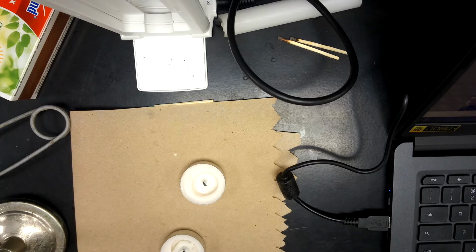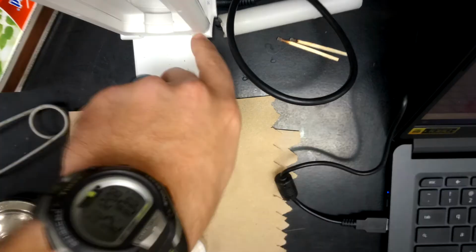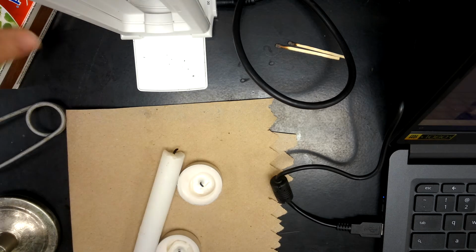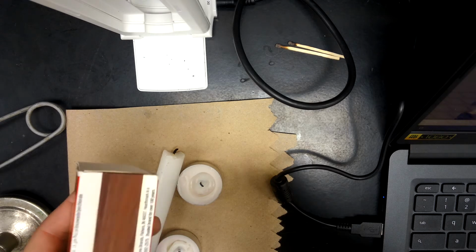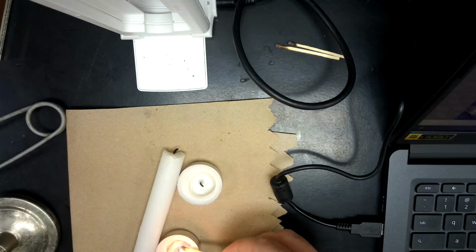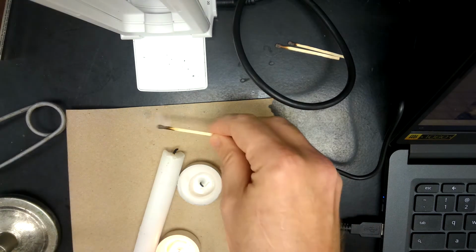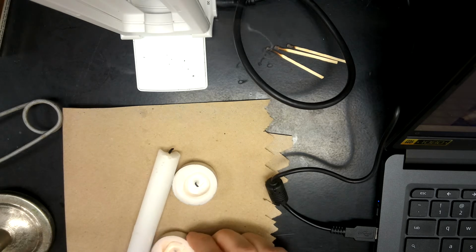First station says to use a match to light a candle and watch the wax. It doesn't matter what kind of candle I end up using. Let's go with this one. It's kind of funny in class to watch how many students struggle to light a match. It's like we haven't done that before. Maybe that's you, maybe it's not. But either way, Mr. Wilson's good at fire, so we'll have no problems there.